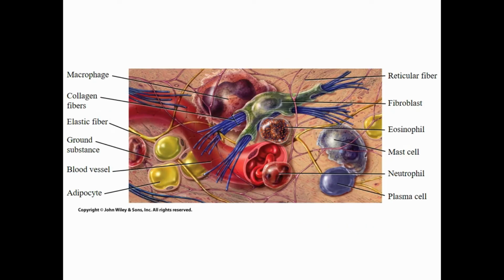All right, so here's that general overview of connective tissue. This is really no particular kind. It just is a generalized view because it has everything. So it contains the fibroblast, which is the cell making all the fibers. You have white blood cells. You have the macrophage. You have collagen fibers, elastic fibers, the ground substance. Remember, that's the stuff that is the extracellular matrix. Remember my analogy from the other day, that would be the peanut butter in the crunchy peanut butter analogy.